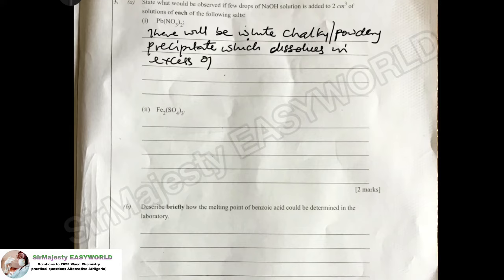The white chalky or white powdery precipitate, which dissolves in excess of NaOH. Simple.